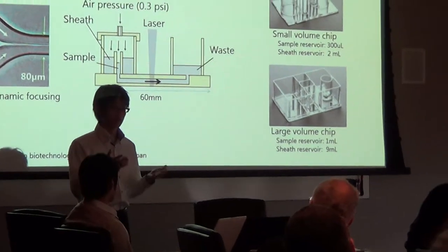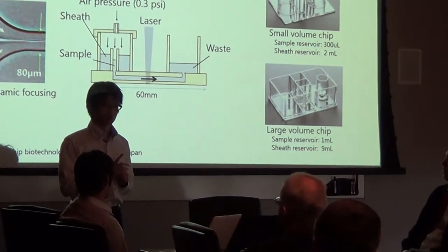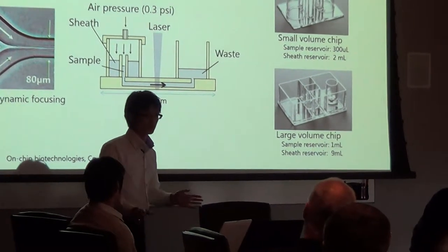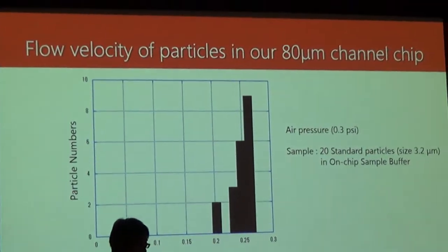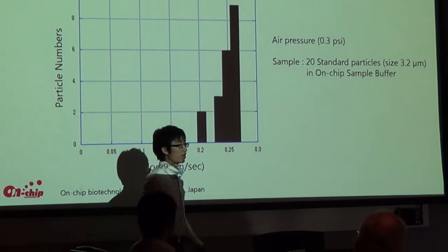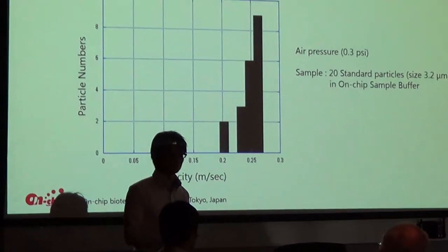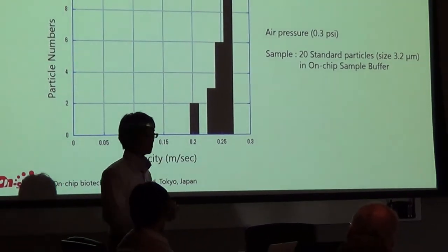So if you would like to run samples much quicker, we can apply higher pressure. But the pressure that's been applied and also the shear stress that is being applied to the cells is actually a lot lower, as he's mentioned earlier. That's so low that it's almost negligible. Anyway, the velocity of the particles running in that channel tends to average out to about 0.25 meters a second. Unfortunately it's not in the unit that you normally use maybe, but I just wanted to show that this is nice and consistent.